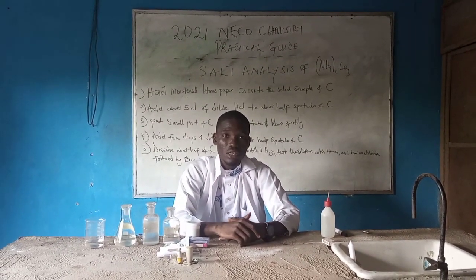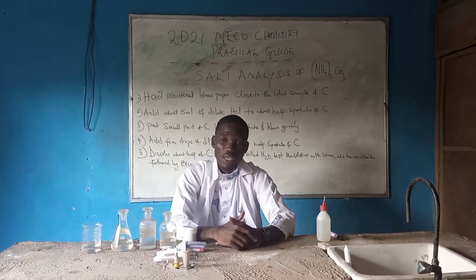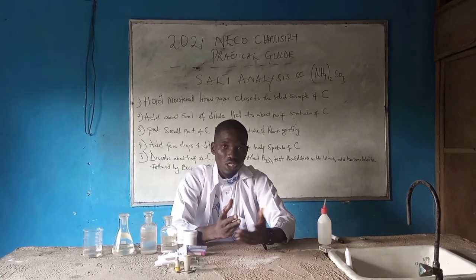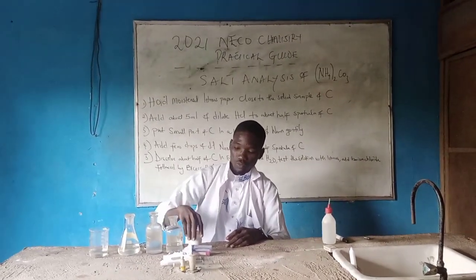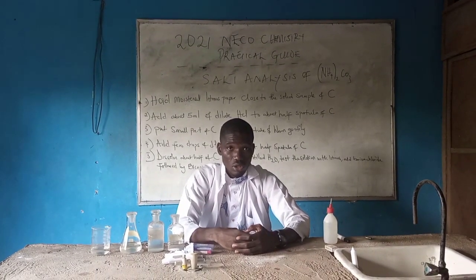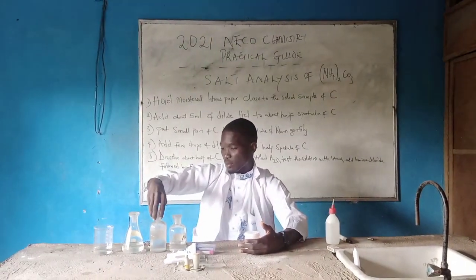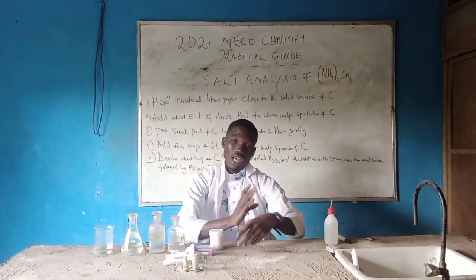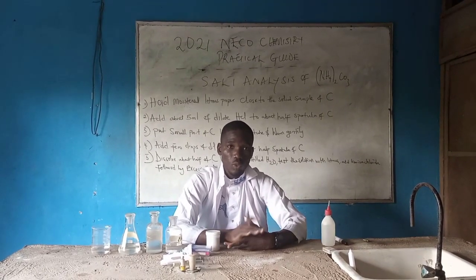The salt we want to analyze is ammonium carbonate. When talking about ammonium carbonate, they are unstable when heated, and you can easily perceive the odor because they easily give off ammonia gas. Now look at what you have on the bench here. I'll be using baking powder to substitute ammonium carbonate, and we also have dilute HCl, barium chloride, and sodium hydroxide with conc. HCl.